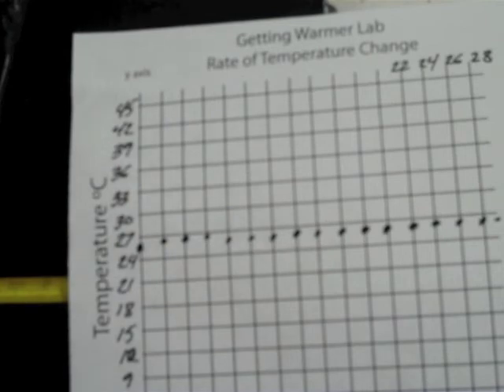Following this video, watch for some pictures of the students in class working on the same lab. There were some students who did have results that changed about four degrees. In this instance of my lab trying to recreate it, we didn't have the results we were looking for. There are other exothermic labs that could better show temperature changes going up and down — so this lab is probably not the best one to do in the future. But I hope the students enjoyed it, and I look forward to seeing you next time.